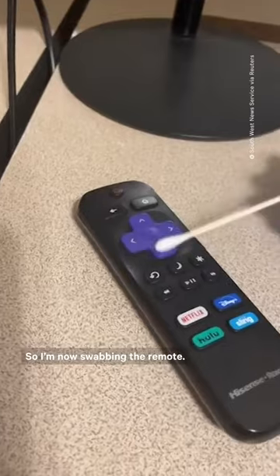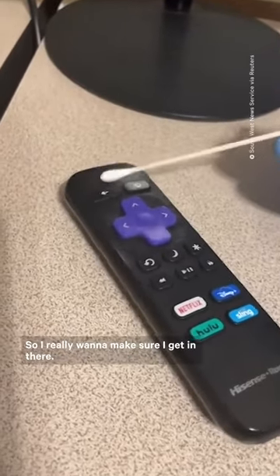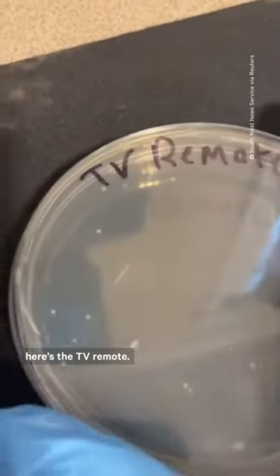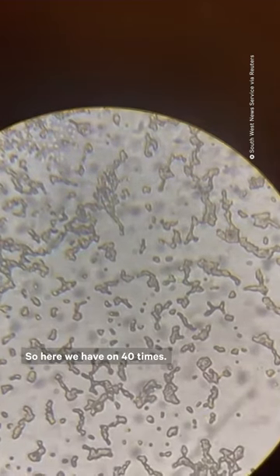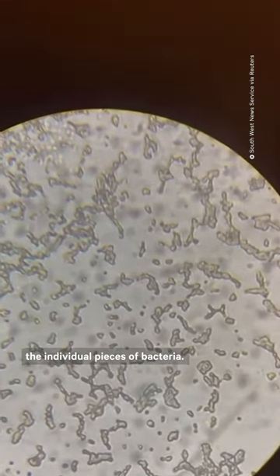I'm now swabbing the remote. This is the most used button of course — it's the on/off button — so I really want to make sure I get in there. So here it is, here's the TV remote. On 40 times magnification you can really see more closely the individual pieces of bacteria.